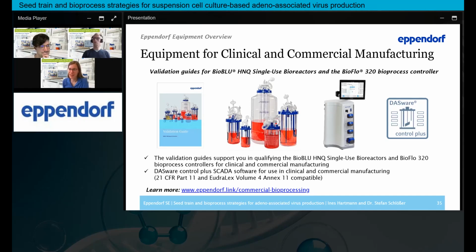But I've also seen newer flasks with higher fill volumes. These optimum growth flasks have different designs, with a steeper neck. But you have to use them with a little higher RPM agitation, and you can go to higher fills. So 40% is, I think, more or less the maximum.